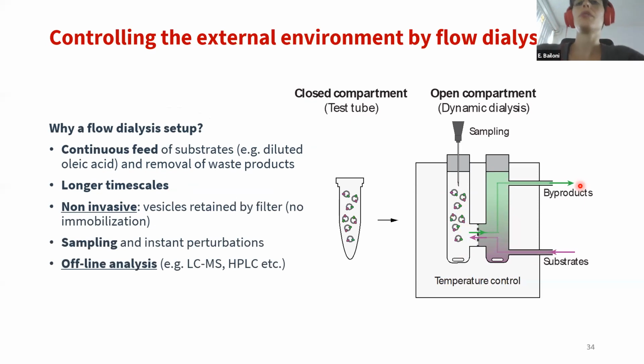And why would we need to use a flow dialysis setup? What are the advantages, for example, compared to microfluidic devices or other techniques? Well, first of all, as I said, we need a system for continuous feed of substrates, and in particular for the continuous feed of diluted oleic acid, as well as the removal of waste products.